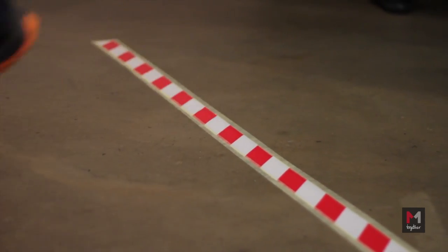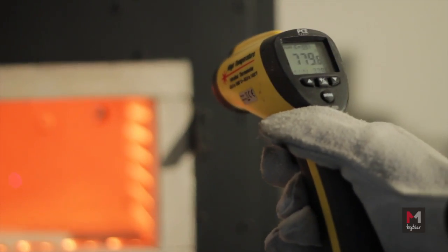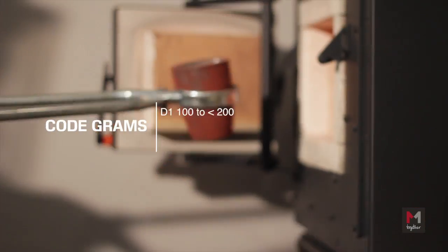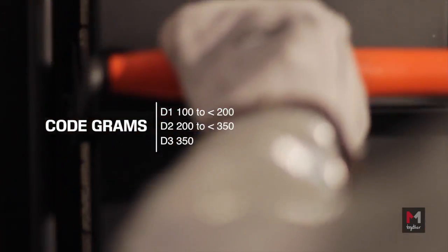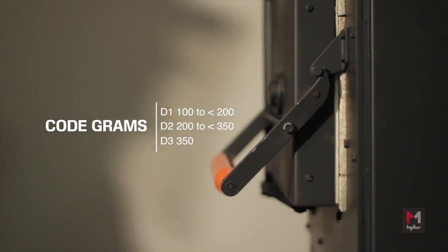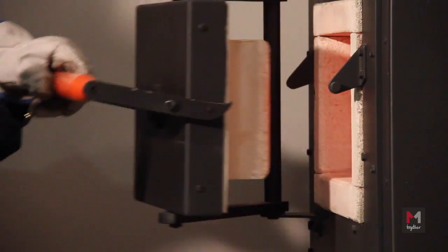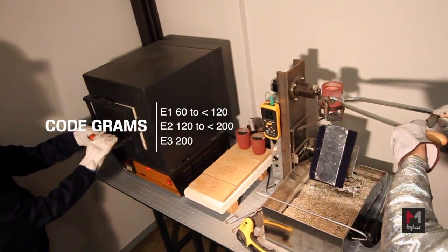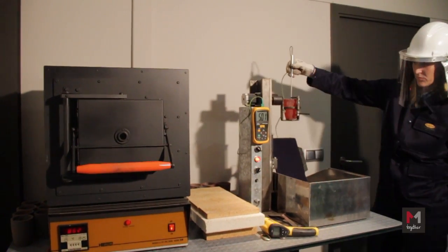The three levels are D1, D2, and D3 for Aluminium, and E1, E2, and E3 for Iron and Steel. These levels correspond to the following classification by grams: D1 = 100 to less than 200g, D2 = 200 to less than 350g, D3 = more than 350g. E1 = 60 to less than 120g, E2 = 120 to less than 200g, E3 = more than 200g.